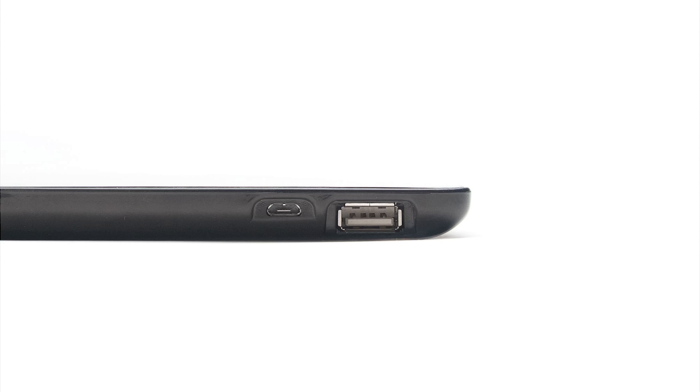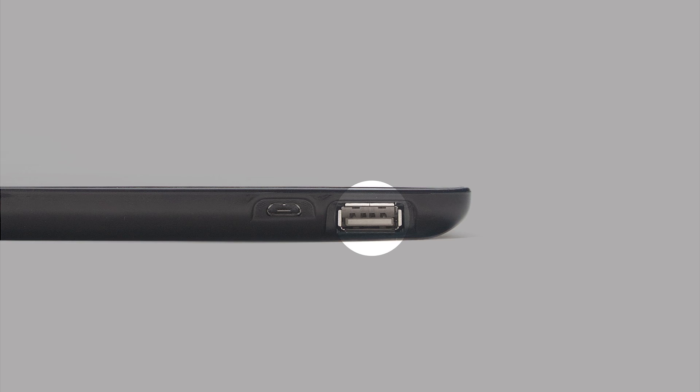It has two USB ports: one standard USB for exporting data with a flash drive, and one micro USB port for connecting to a computer for file export and for charging your EDGE when the cradle is not available.